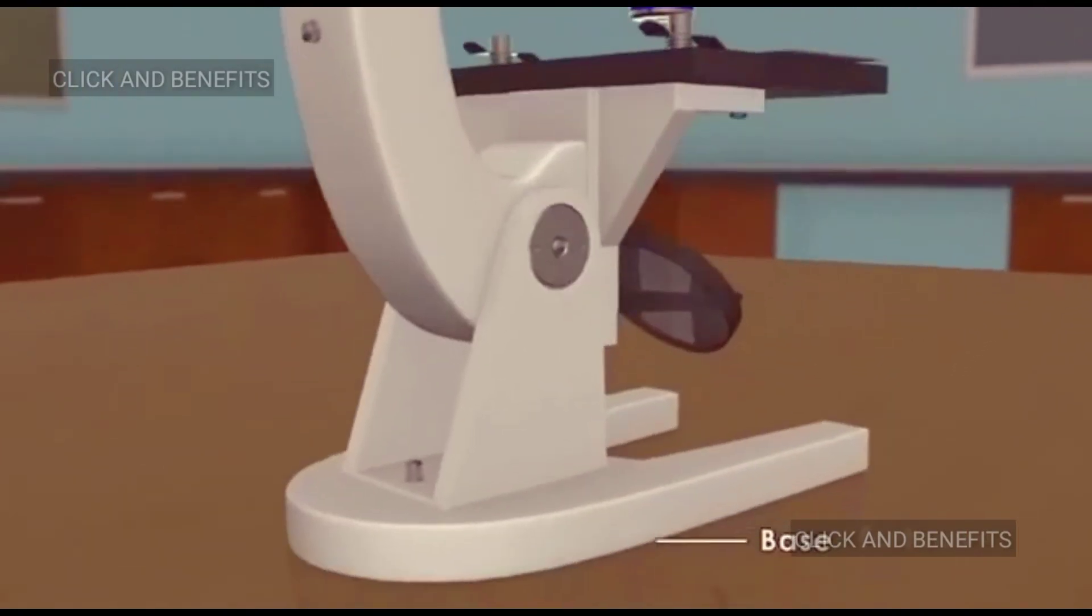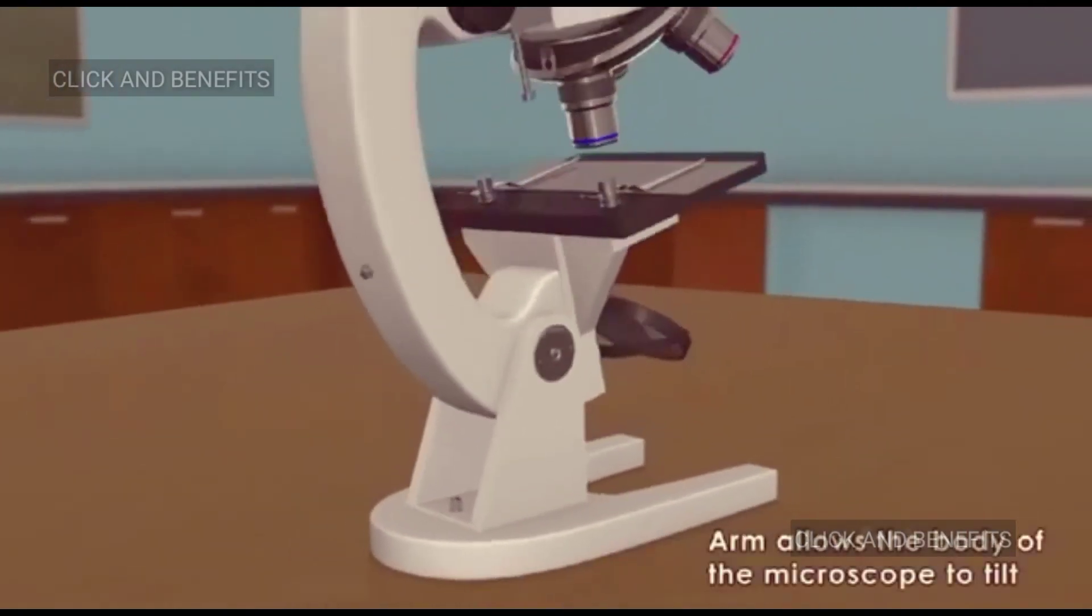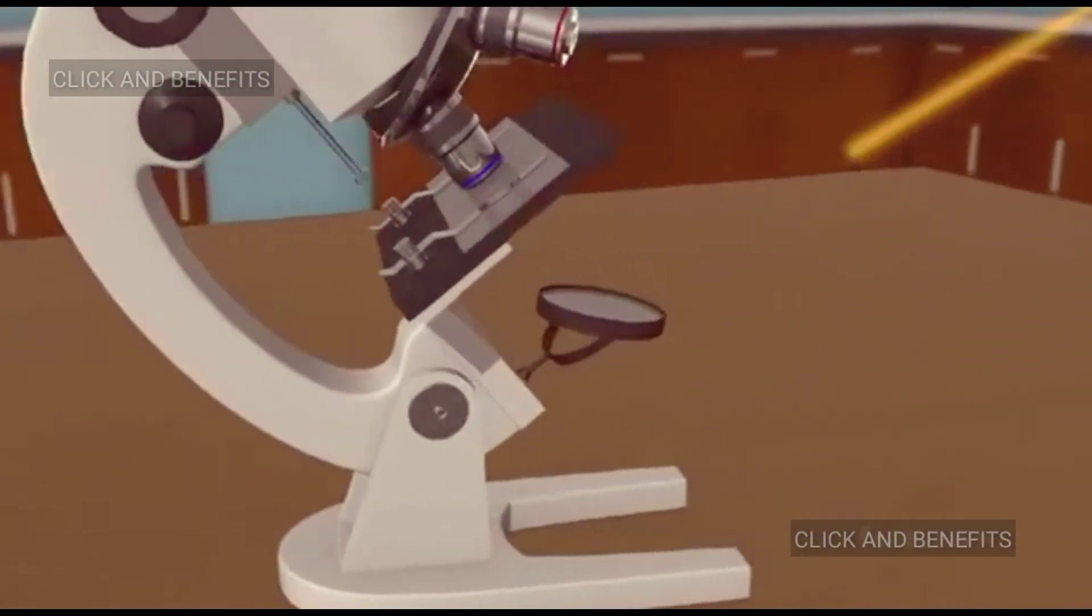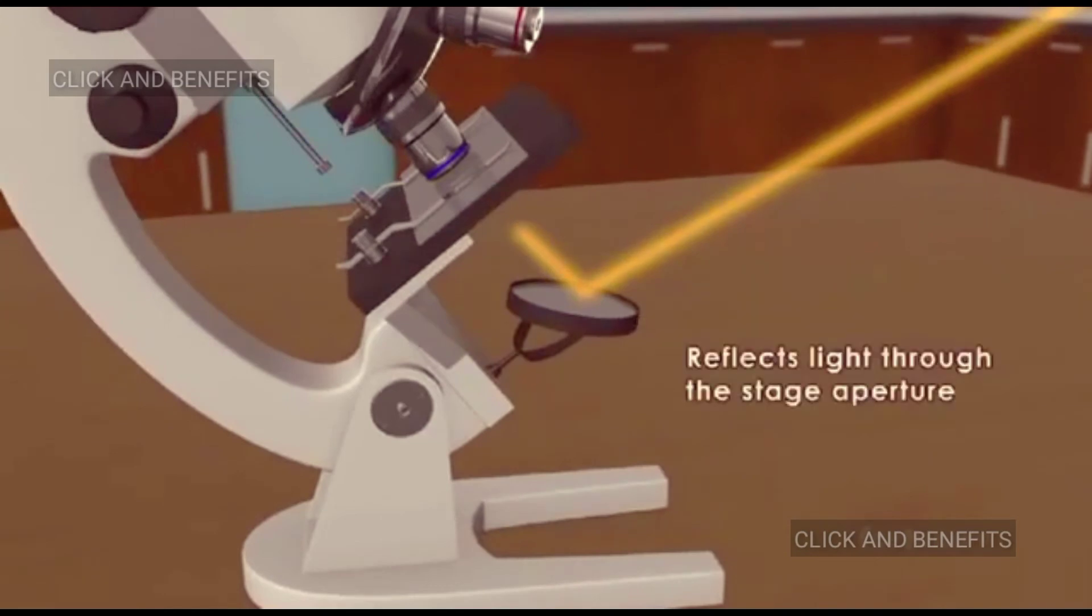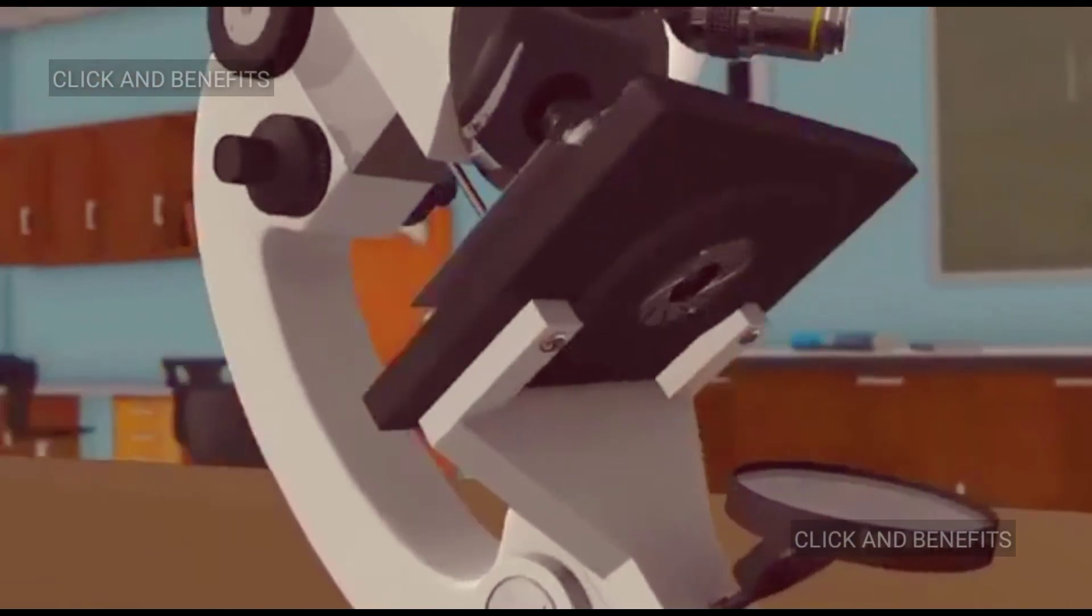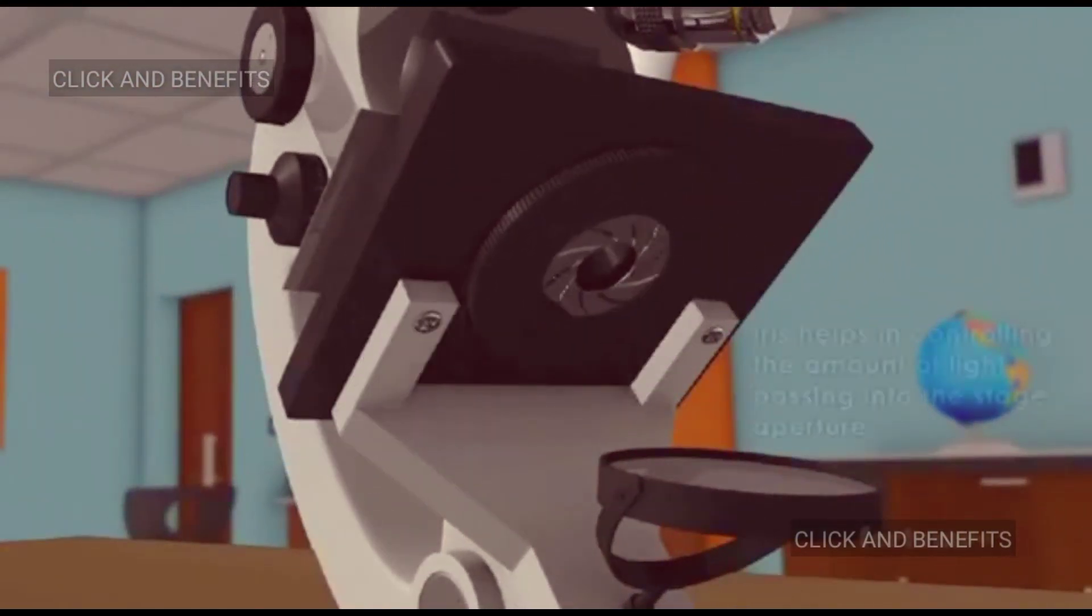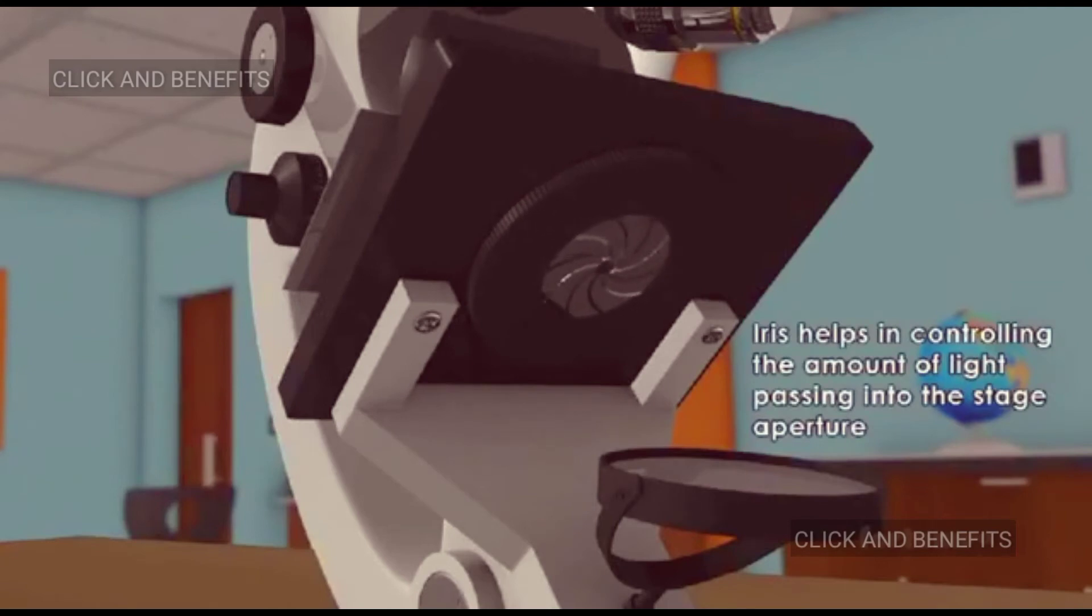The body tube is arranged on an arm which is connected to a strong base. This arm allows the body of the microscope to tilt. A small mirror at the base of the microscope reflects the light through the stage aperture. Above the mirror, an iris, also known as a diaphragm, is present. The iris helps in controlling the amount of light passing into the stage aperture.